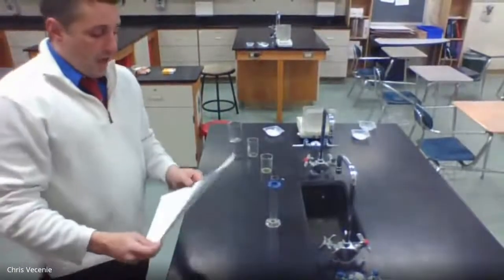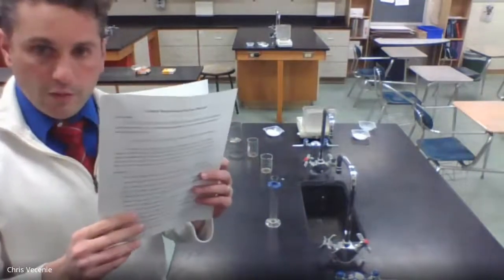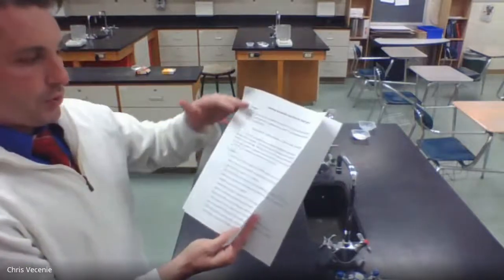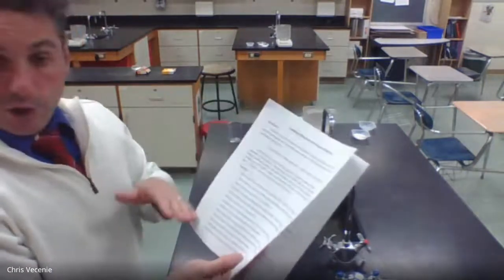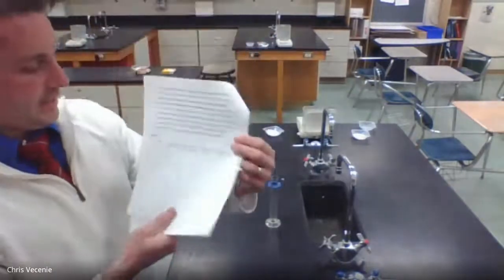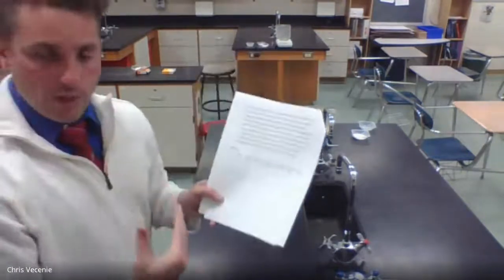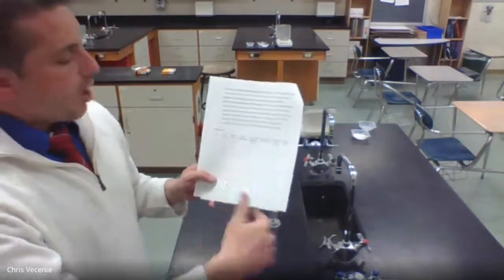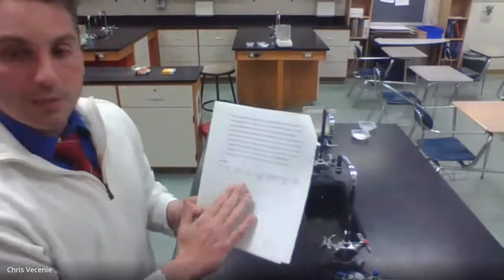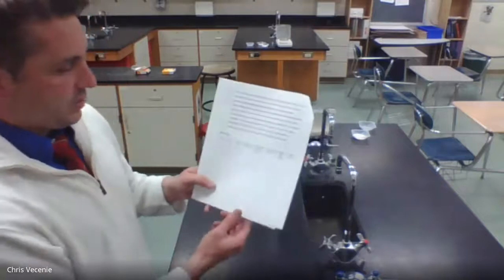If you take a look, there are two things attached to the video that you're watching. One is the packet describing the experiment. I just walked you through all of the pre-lab stuff. We are going to go through the procedure together to gather our data for our data table. I'm going to give you this top line as we go through this video. I'm going to repeat the process with the 1 gram and the 0.5 grams, but you don't need to watch that part. I'm going to simply send you a picture of what the data for the second part of the experiment is going to be.